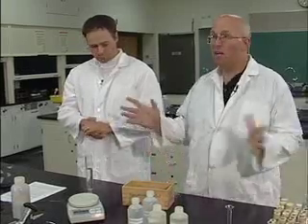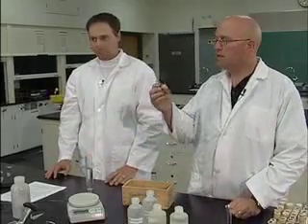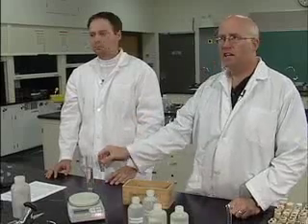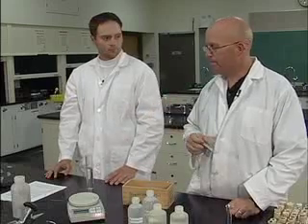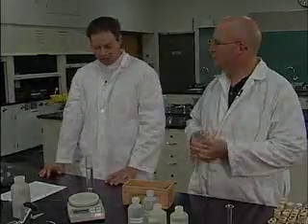Okay, so that's all that we have to do to figure out the density of any one of these objects. Figure out how much it weighs, put it in the graduated cylinder to figure out the volume of it, divide the two numbers, and we come up with our density. I think that's good. Yeah, okay. Anything else on that one? No, that one's pretty straightforward.